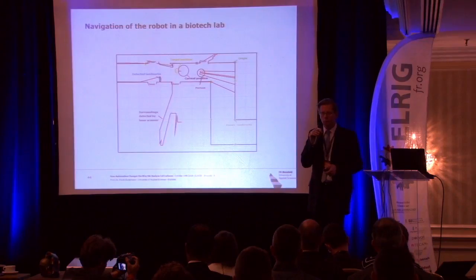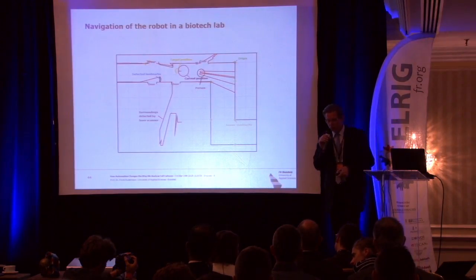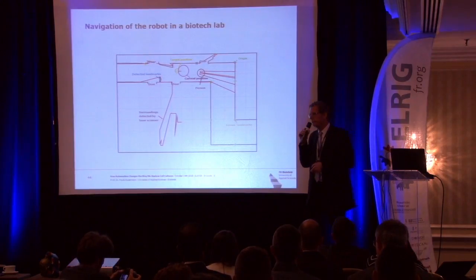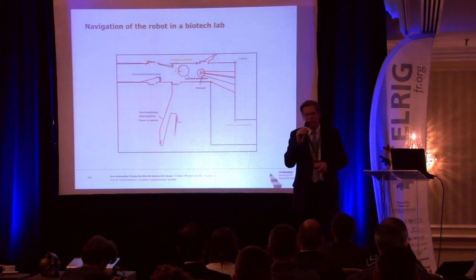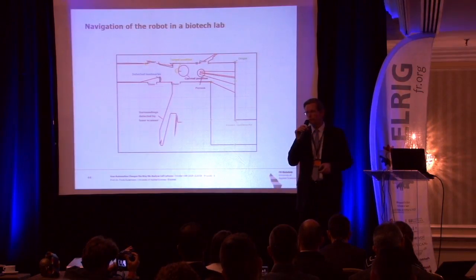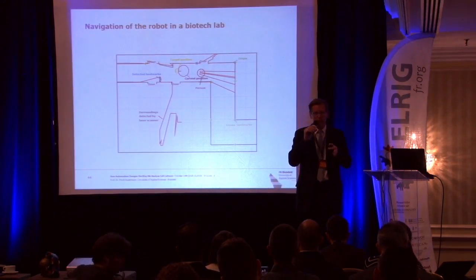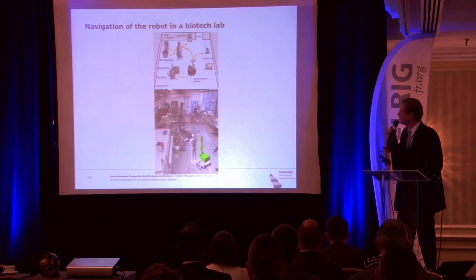And I will show you a short movie, about three minutes 10 or something like that. In the movie the speaker will refer to some marks that are on the centrifuge, on the rack of sample cups, for example, and these marks are the yellow squares that you will see in the movie, with additional little blue and red marks. The blue and red marks are a code for the instrument or the sample cup rack that the robot is standing in front of. And the orientation of the mark also determines the orientation of the centrifuge, for example. Because that is the zero point, these marks determine the zero position and the coordinates of the centrifuge and its orientation in the room.